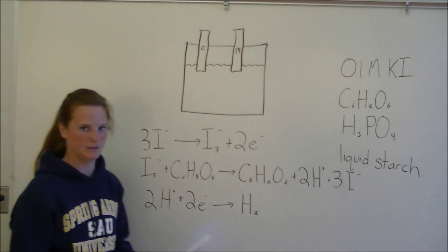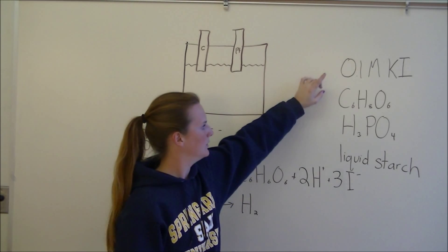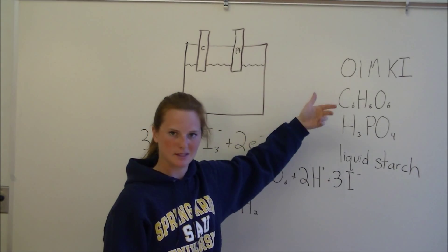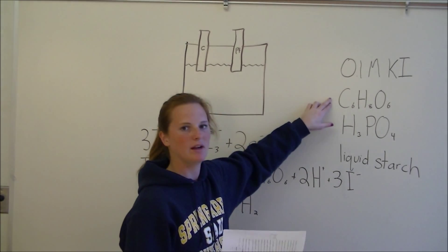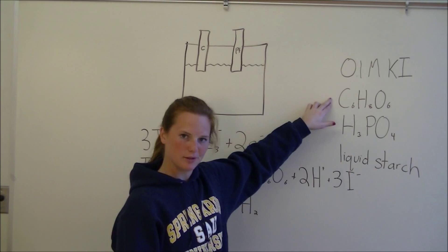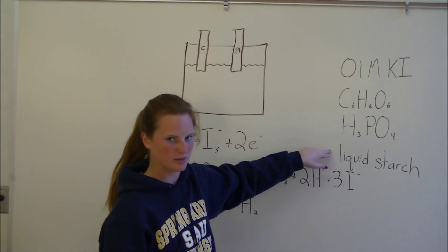Our solution is going to be comprised of 0.1 molar potassium iodide, some ascorbic acid or vitamin C provided in the form of orange juice, some phosphoric acid, and some liquid starch.